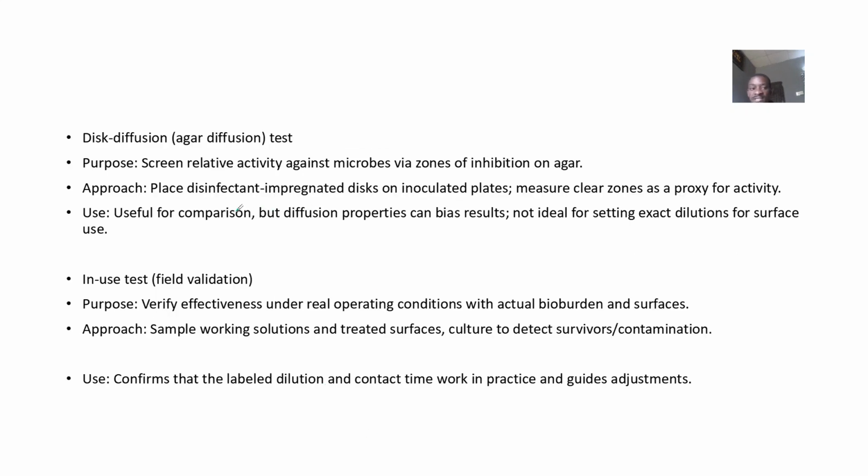Then we also have the disk diffusion, also known as the agar test. So it screens relative effectiveness against microbes. Okay, and this one uses the zone of inhibition. So if microorganisms are growing and I pour a disinfectant, how many of those microorganisms are killed? So when those microorganisms are growing and you put a disinfectant, the place where they are killed becomes clear. So they call that the zone of inhibition. Okay, so that's just it.